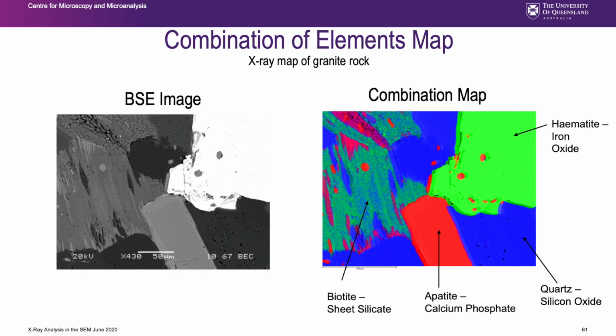They're very big, strong crystals with a significant amount of the elements of interest in them, and it produces a very strong map. To the left, we've got a much more complex mineral. That's a biotite, which is a sheet silicate, and it contains different elements in different proportions.